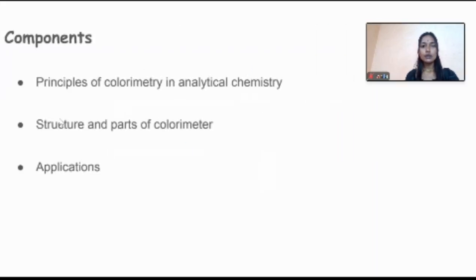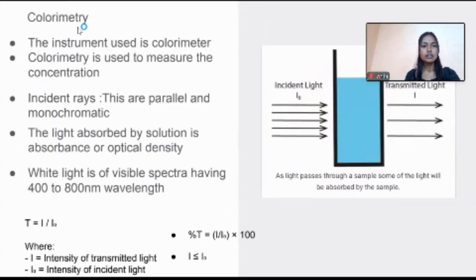In today's video I am going to explain what the principles of colorimetry in analytical chemistry are, the structure and parts of a colorimeter, and what the applications are. So let's know what colorimetry is by taking an example.